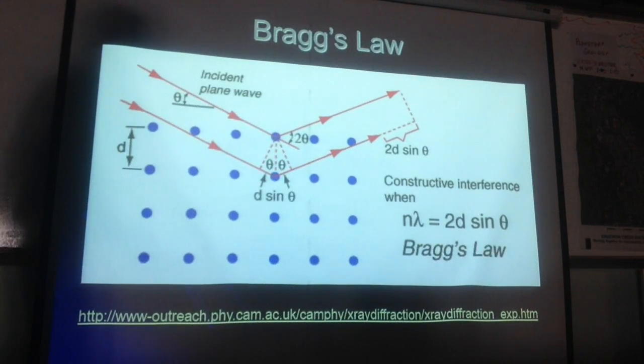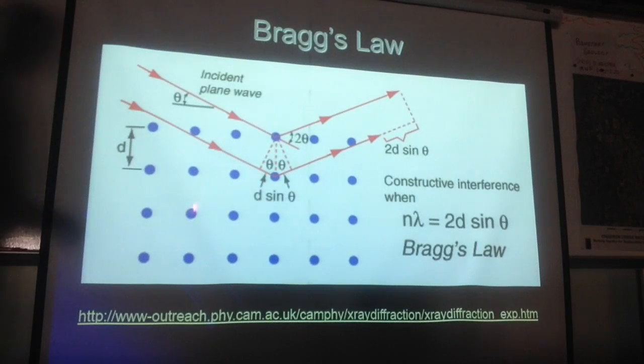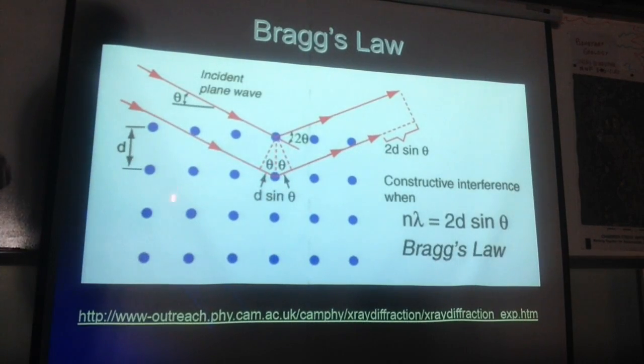So what we can see here is your crystal, and these are the atoms inside your crystal, these blue dots, and this is your D-spacing.